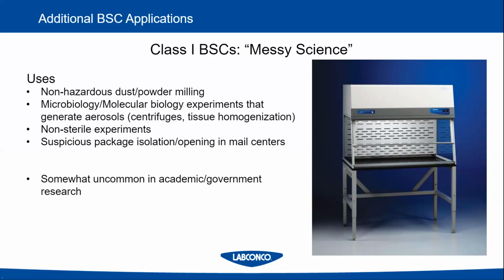Another safety precaution for a class 2 biosafety cabinet is never using open flames, say a Bunsen burner for sterilizing a loop for picking cells. Those open flames, also the heat plume, disrupt the laminar flow and can actually damage the HEPA filter and cause serious containment issues. So centrifuges and open flames are two things that should never be used in a class 2 biosafety cabinet.